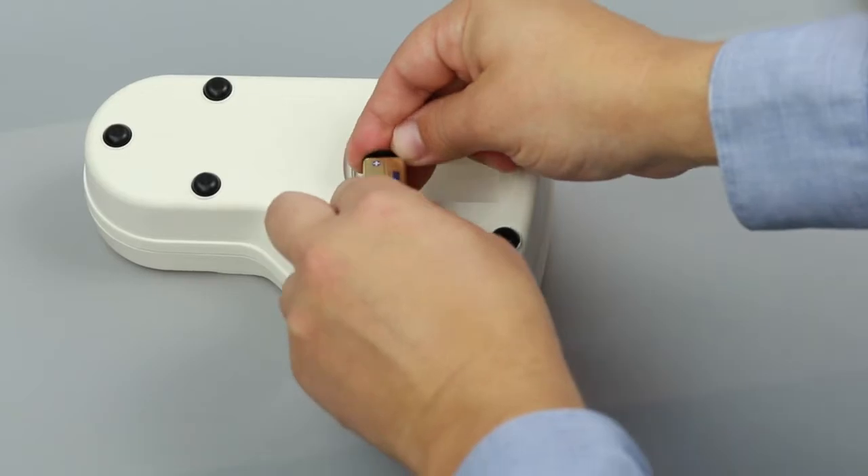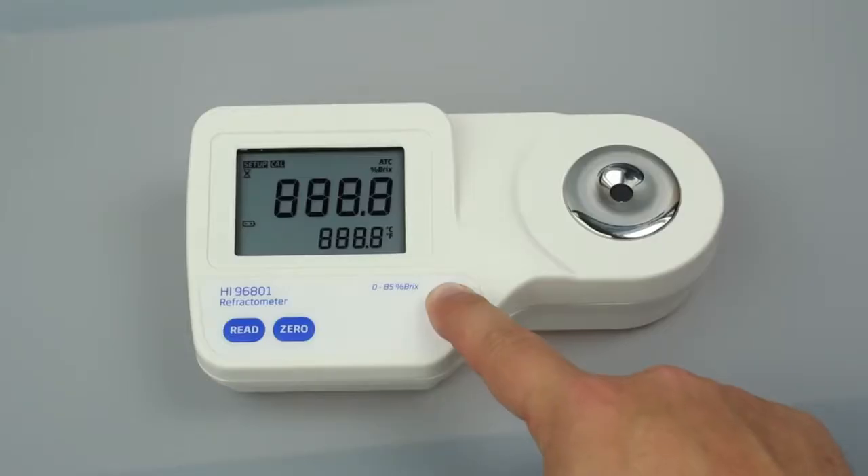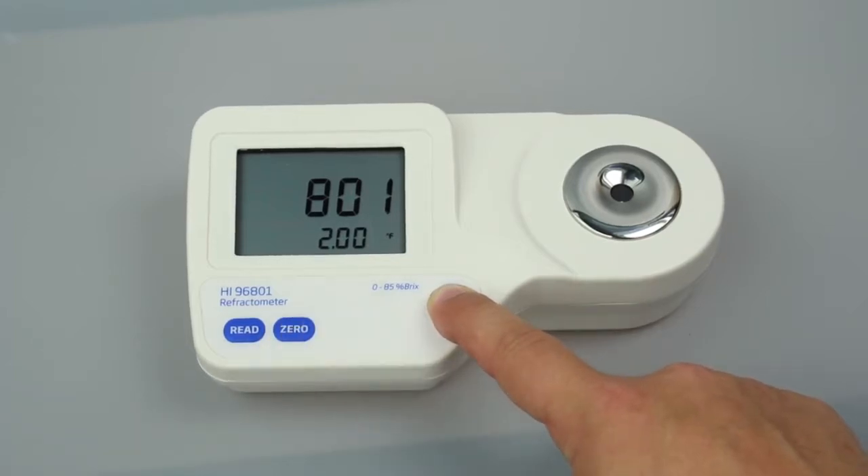To set up your meter, install the 9-volt battery in the compartment. To select your temperature units, press and hold the ON-OFF button until the screen flashes. Continue holding ON-OFF and press 0 to change from Celsius to Fahrenheit. Once you have set your units, the refractometer is ready to be calibrated.